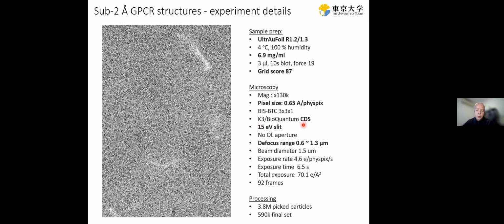We still have the issue though that the first frame of the movie has a lot of systematic noise, a lot of pattern noise, so we have to throw away the first frame. I hope that one day this will be fixed with a firmware update. The last attempt to fix it on our microscope didn't succeed. Actually, it made things worse. So they reverted the firmware, but we still get more crashes during data acquisition.